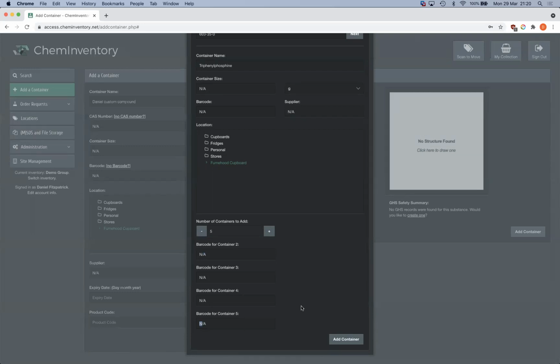One other major feature for using barcodes is the stock take tool, which I'll go through in a few minutes. But also from a regulatory compliance perspective, it can be useful as well. For example, to report on consumption of particular chemicals within, say, a 12-month period. Using barcodes helps you maintain records of levels or quantities of materials for regulated chemicals between years.